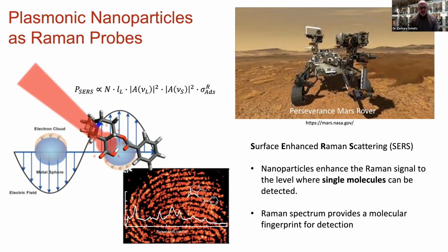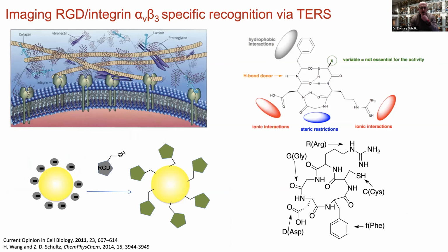in our Raman images. And so we've had enough people talking about SERS, I don't want to belabor the point, but this plasmon resonance basically increases the scattering from molecules near the surface, such that with certain molecules, you can go down to a single molecule type level. For many biologically relevant molecules, you can get down to biologically relevant concentrations using the full spectrum again to resolve what you're looking at.